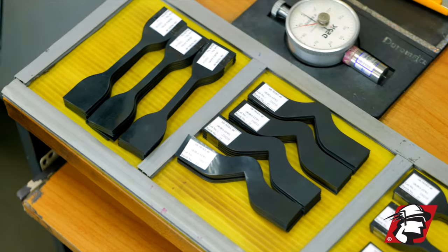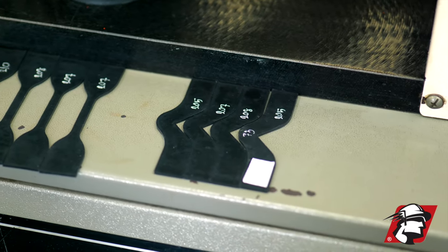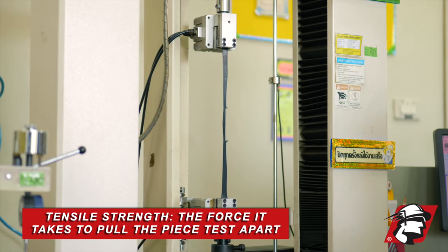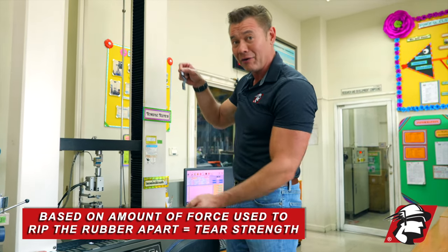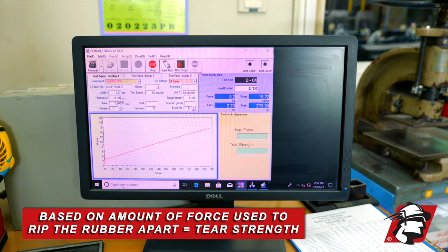We also have what we call a tear test piece — it has a cut in it, or a simulated tear. When we stick this into the tensile machine, it will be pulled apart and break, and based on the amount of force it took to tear it apart, it will tell us the tear strength of this rubber compound.